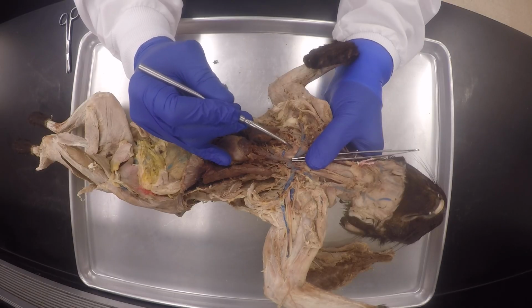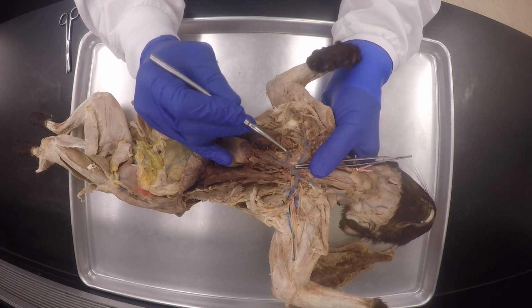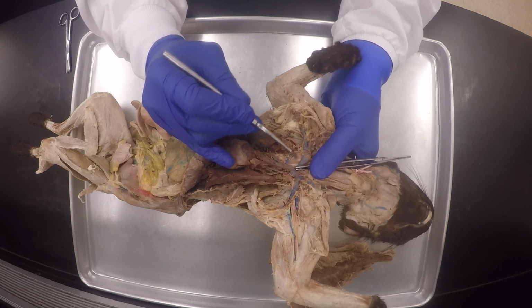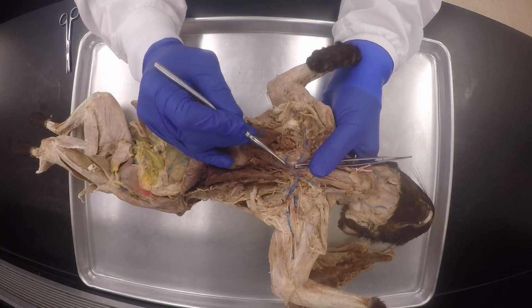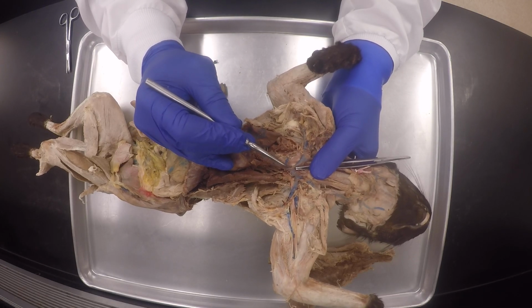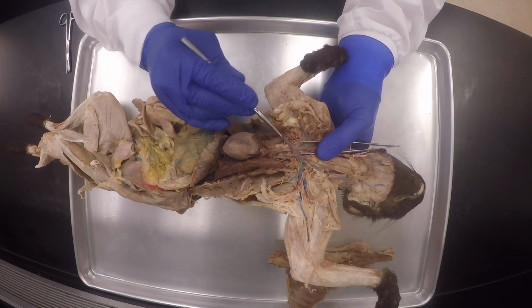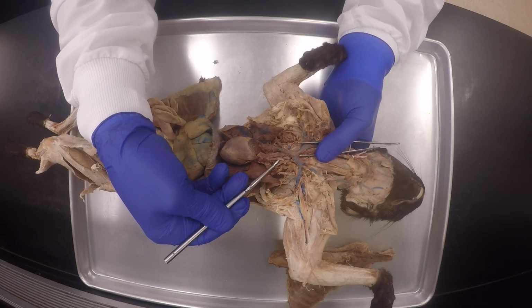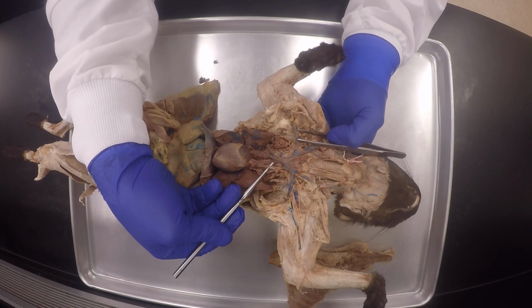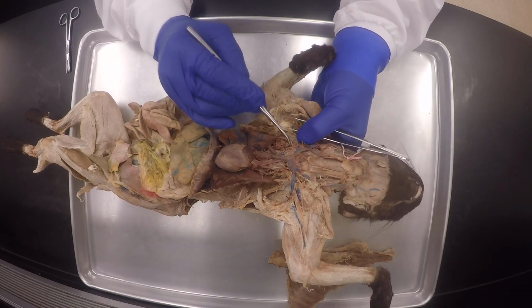And you could see that it's not very well infused, obviously. The internal mammary on the right. So there's the right subclavian. You see, it's not well infused. This will be nice and red. You'll be able to see it. And there's the common carotid on the right, common carotid on the left. Okay, and there's the brachiocephalic trunk, and then this one is the left common carotid. Okay, and then again, this is not well infused.